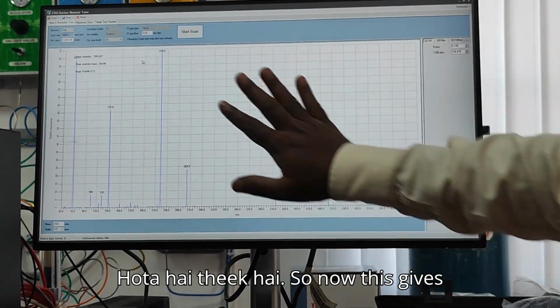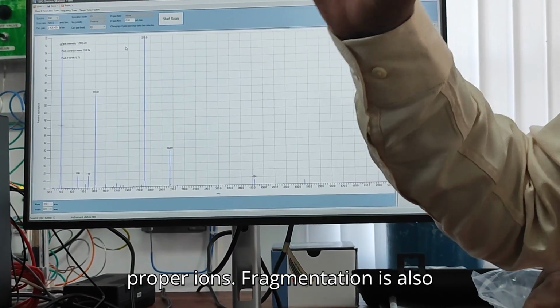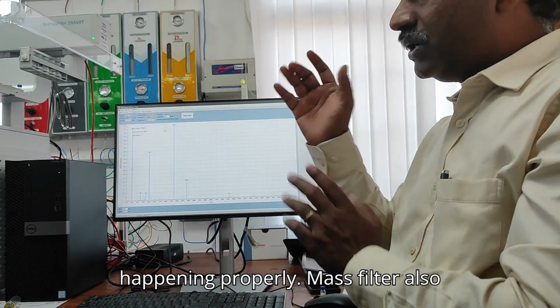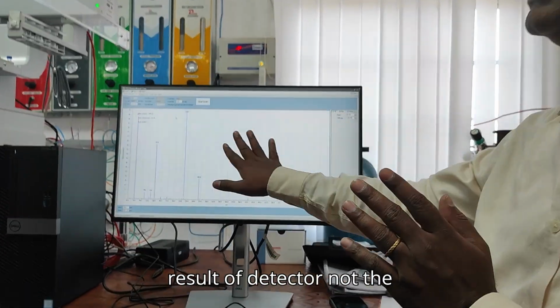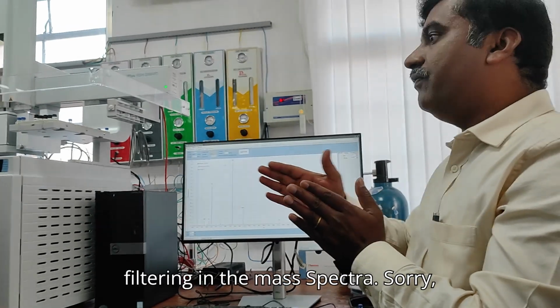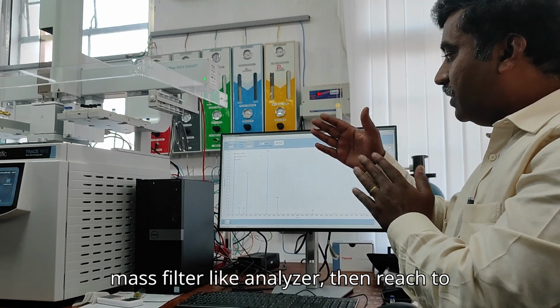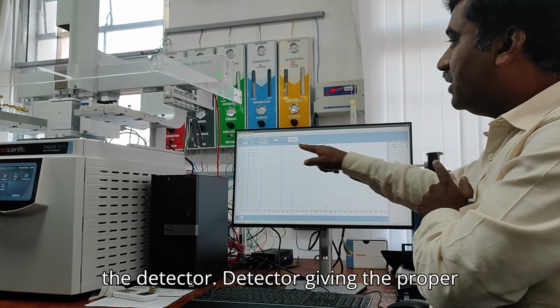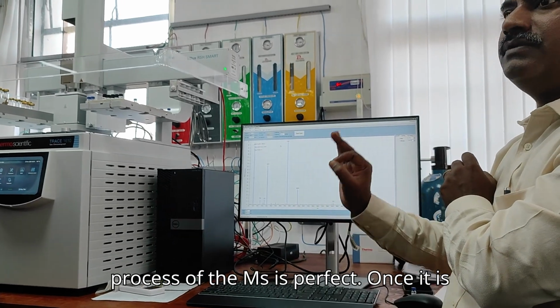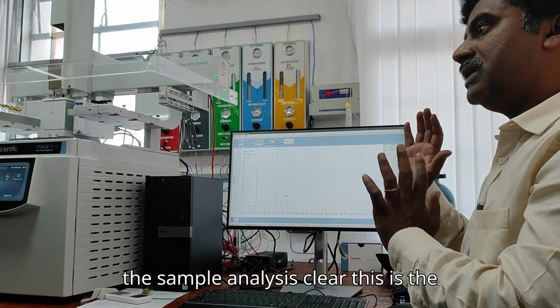So now this shows the ion source is generating the proper ions and fragmentation is also happening properly. The mass filter is also filtering, because this is the result of the detector, not just the ionization. The masses are properly filtered by the mass filter, the analyzer, then reach the detector. The detector gives the proper response as well, which means the functioning of the MS is perfect. Once it is confirmed, we can easily start working on the sample analysis.